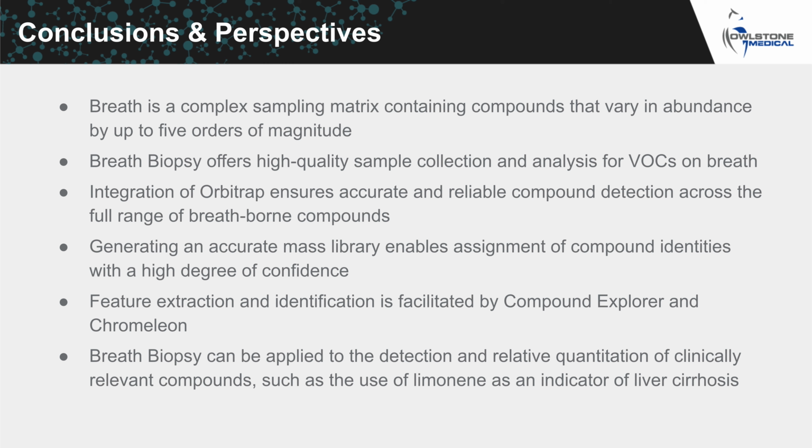The integration of Orbitrap mass spectrometry and the latest analysis software, combined with an accurate mass library, offers the capability for reliable biomarker identification and monitoring. Targeted analysis of specific VOC panels is also possible for a growing selection of compounds. We have applied this technology to validate results indicating a relationship between limonene and liver disease and to demonstrate that this relationship correlates with other known liver biomarkers.